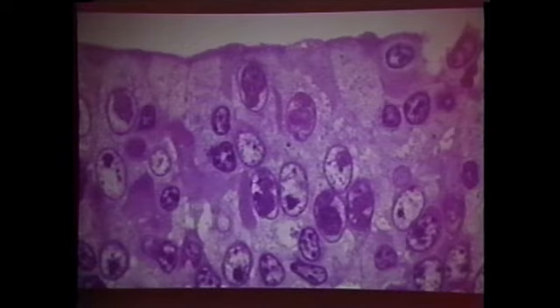Okay, so that's morphology of worms. Now, I'd like to leave you with two cases. I always like to show you interesting things. This is the intestine of a radiated tortoise from my dear friend Elliot Jacobson.